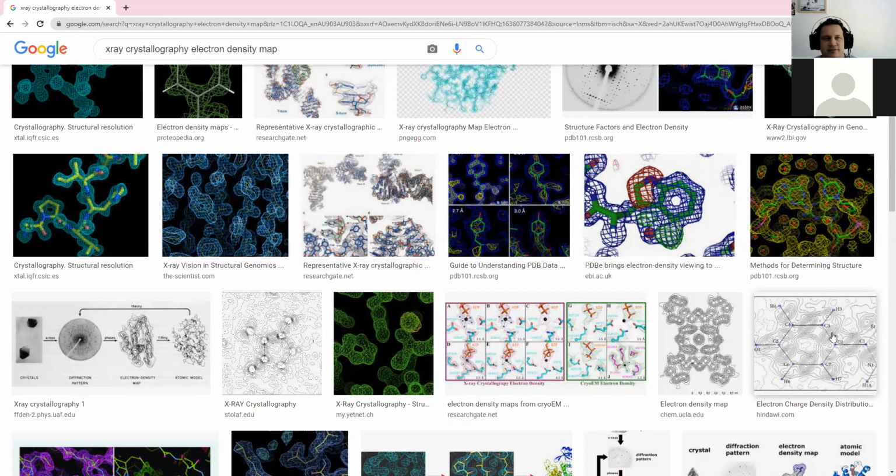Oh, so it's actually hard to make the perfect crystals. Yeah, it's honestly a lot of the time just rapid fire guessing. Because not all proteins will crystallize as well. And if you've got modifications to proteins, then again, it's really hard to make them crystallize.